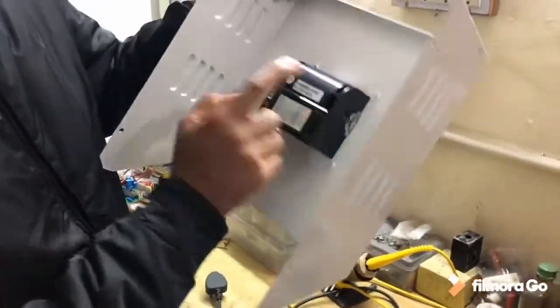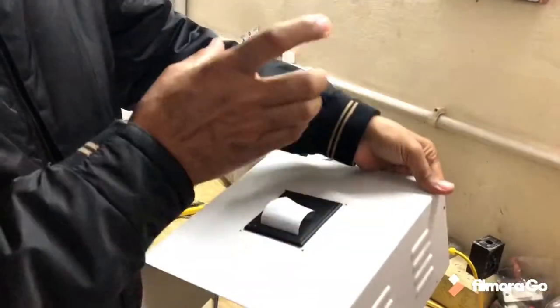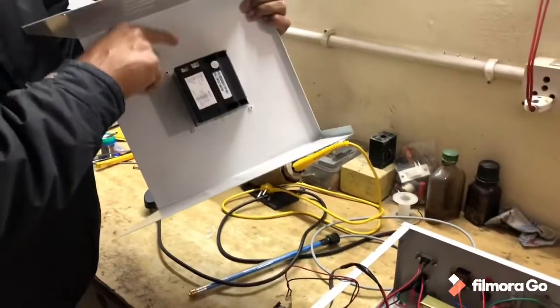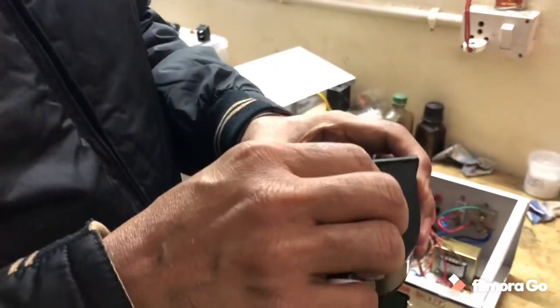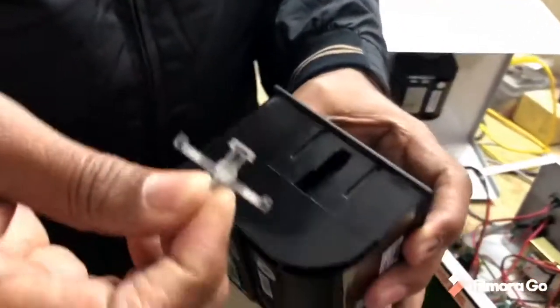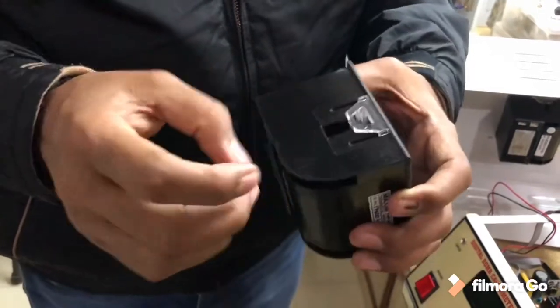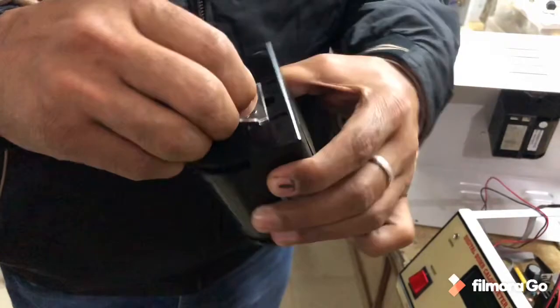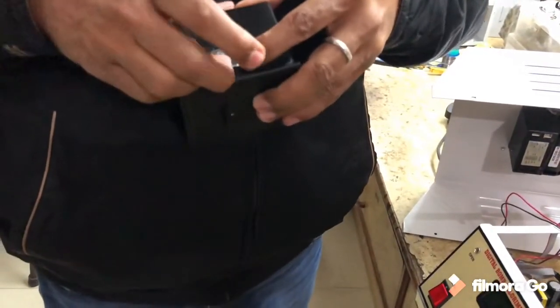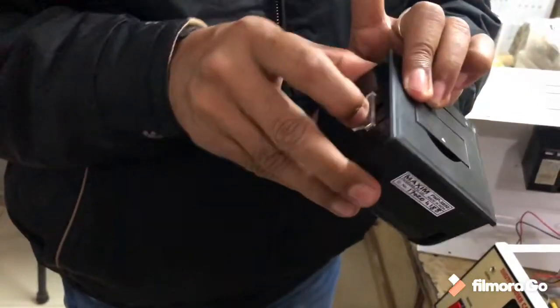There are 2 clamps on these sides. Remove these clamps and then you can take out the printer. Insert the new printer and again clamp these clamps. The mechanism of this clamp is very simple — you just insert the clamp inside and push it. Now it is fixed. To remove the clamp, push it together and then take it out like this.